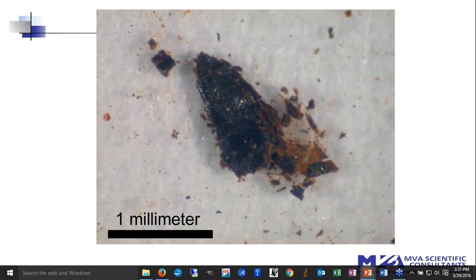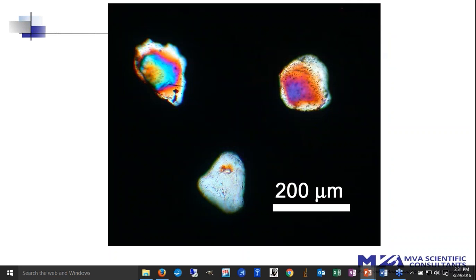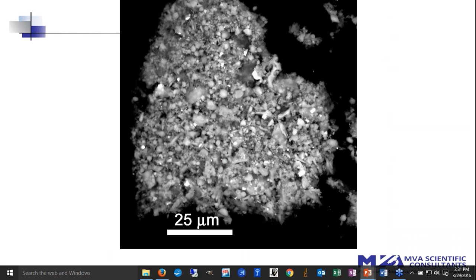Another example of an aggregate, this material was found on parked cars. When it was wiped off or brushed off or washed off, it actually abraded the paint. Inside of that aggregate were glass fibers, glass spheres, quartz particles, and by scanning electron microscopy, you can see there's actually brighter particles, which are iron particles. There's aluminum metal particles, as well as the quartz in the glass fibers and spheres. So it's a very hard sample, which understandably, if it was rubbed across a car's paint, would cause problems.